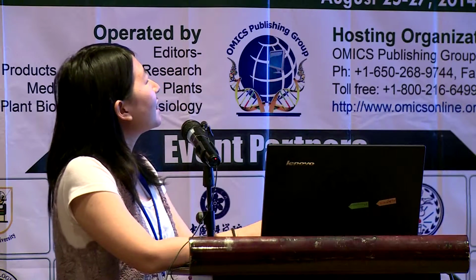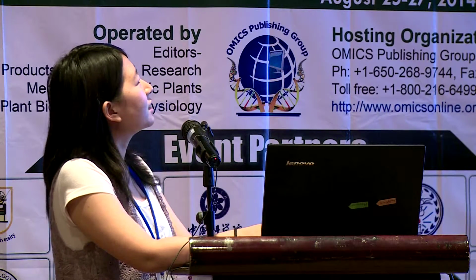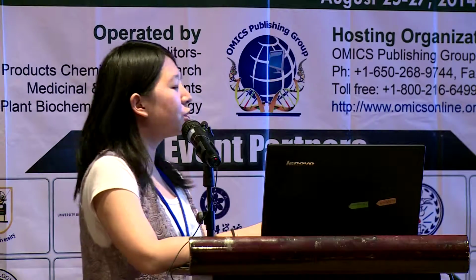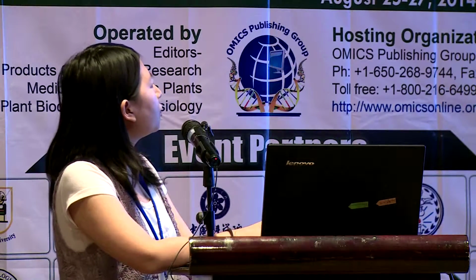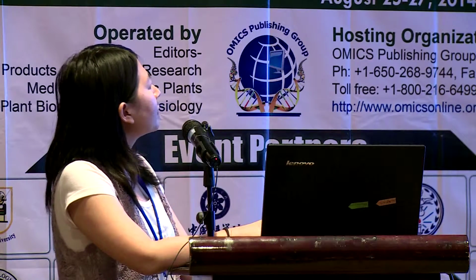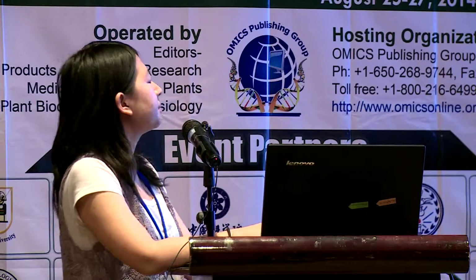The GC-MS analysis of the bulbs of different species of Lycoris results in identification of 31 alkaloids, and the majority of them are classified in the lycorine-type, galanthamine-type, homolycorine-type, crinine, tazettine, and montanine-types.